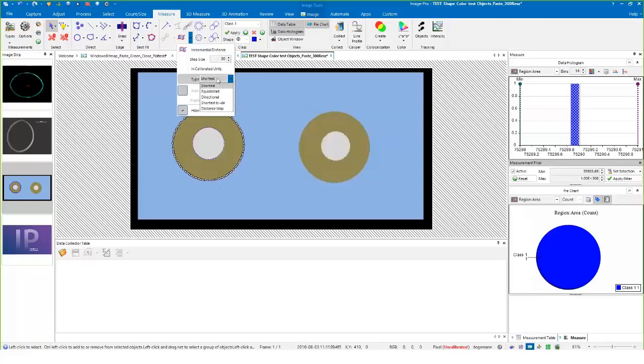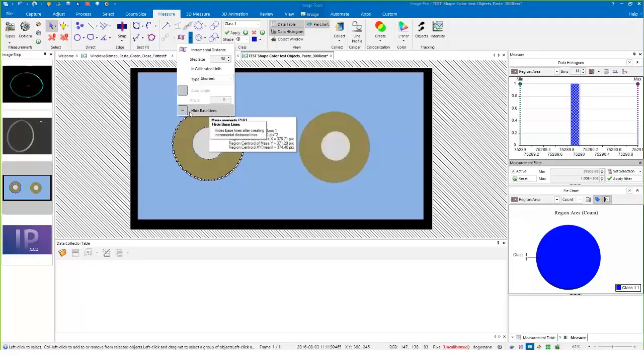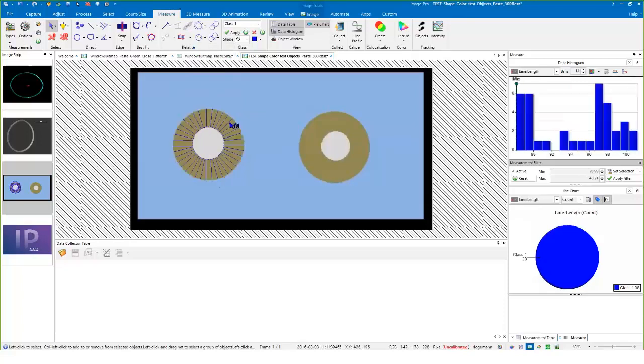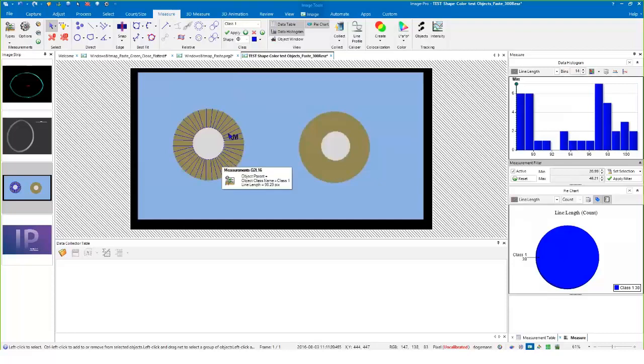Within the options here, there's a step size which dictates how frequently the line segments will show up around this object. There's different types of lines that can show up, and for today I'll just use shortest, which will measure the shortest distance from the outside to the center. I'll hide the base lines in my data table so they don't show up as sum of data.